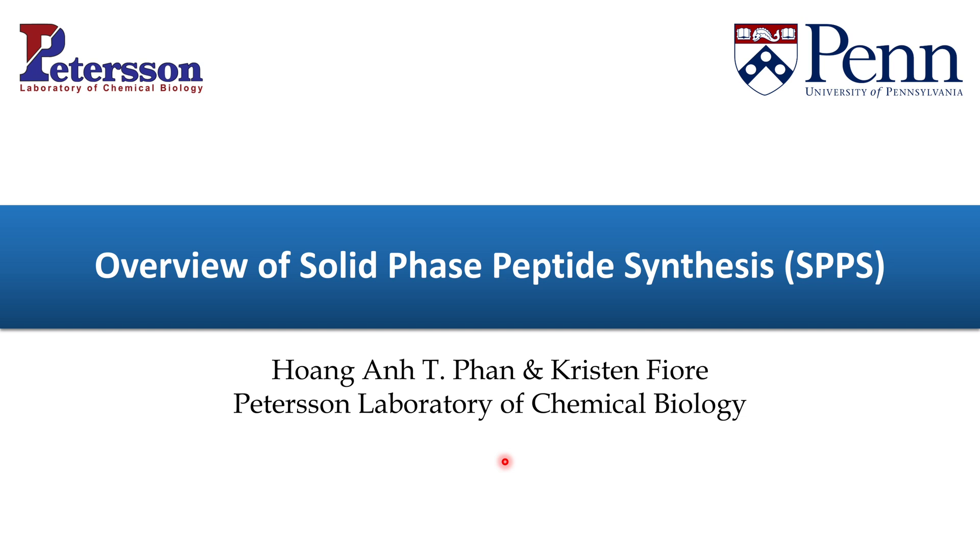Hi everyone! My name is Kristen. I'm a member of the Peterson Lab, and in this video, myself and another member of the lab, Huangine, are going to walk you through how we do solid phase peptide synthesis, or SPPS, in the Peterson Lab.